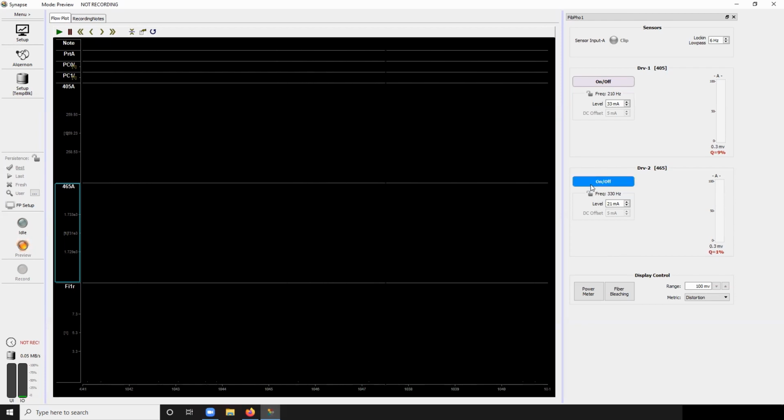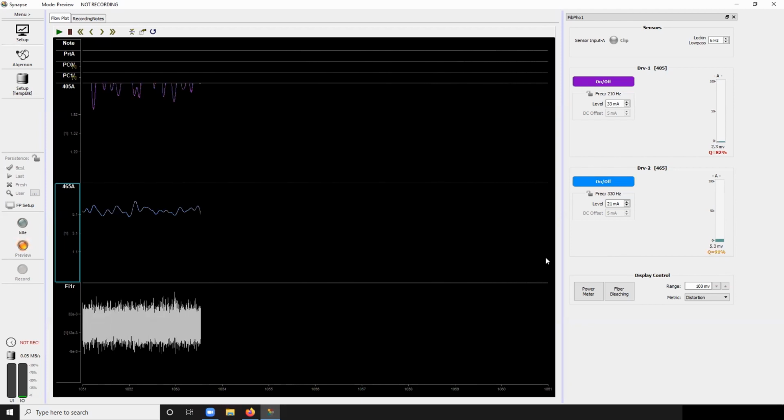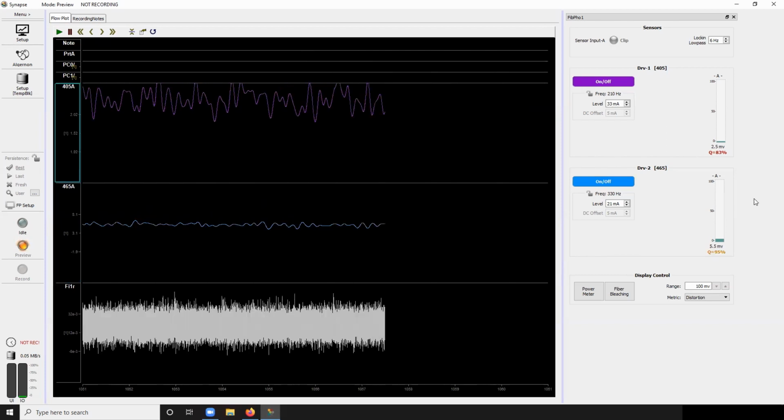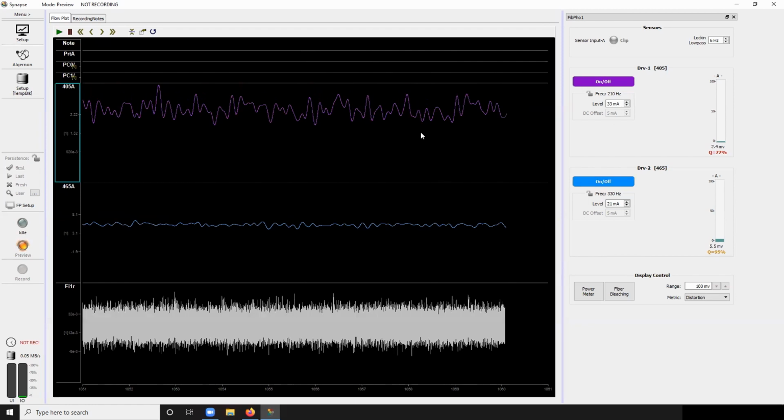What you'll see is, it's going to be a lot lower in terms of signal. That's okay. We're not pointed at anything that's bright and fluorescent. And then you'll see as a result, the Q factor is very low. But what are we going to do now?